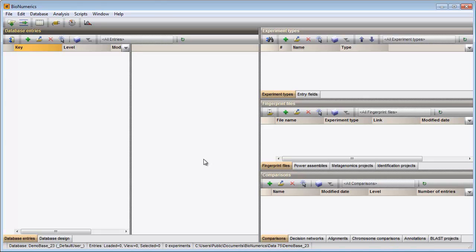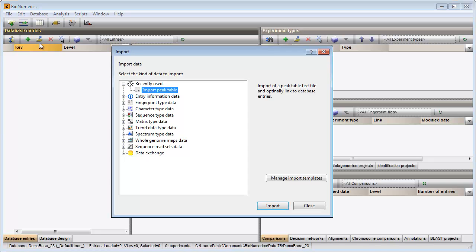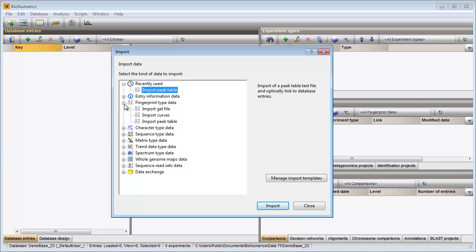In this video, I will import a peak table coming from an automated sequencer. In my example database, I press the import button in the toolbar and select import peak table under fingerprint type data.